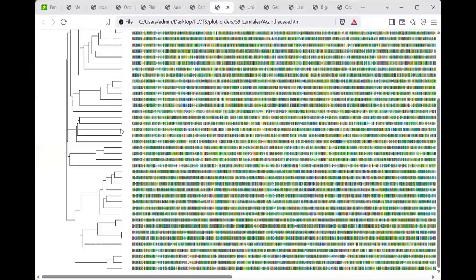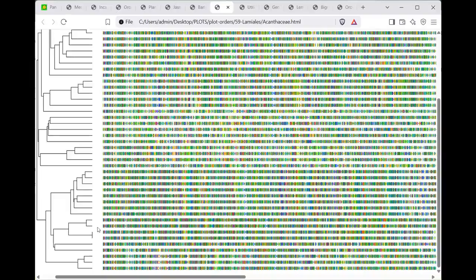In addition, if you look at the sequence pattern, it looks like all these sequences, which are mostly Strobilanthes and one Barleria, they all look similar. Whereas here you have the rest of the Barleria, which all group together. PGR-TK also puts together a phylogeny based on the sequence similarity, and you can clearly see that these Barlerias are all grouped together, and then the remaining Barleria joins with the Strobilanthes here. So based on what I see here, I strongly suspect that this particular sequence, what is given as Barleria, is misclassified. It should be put under the Strobilanthes genus.